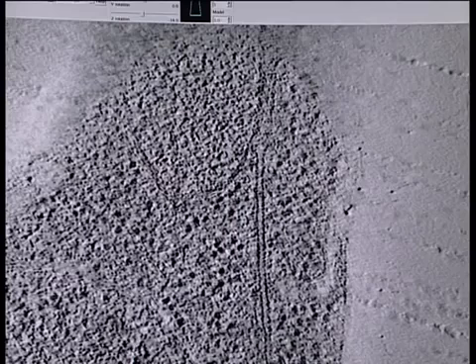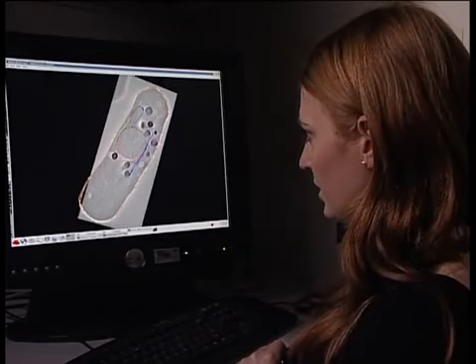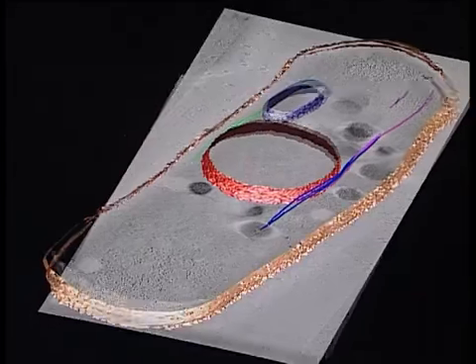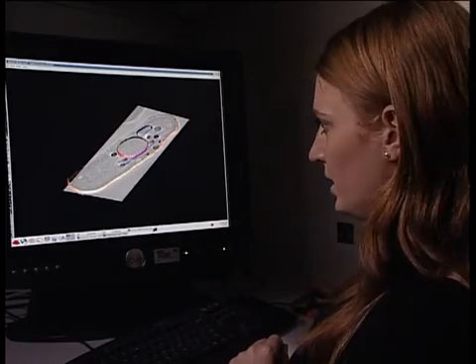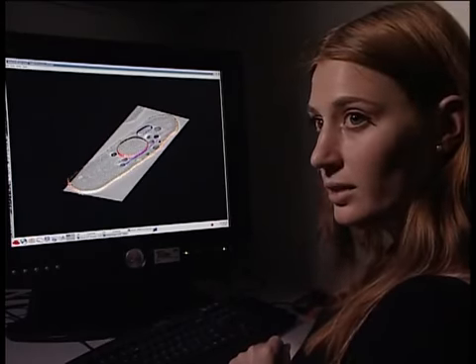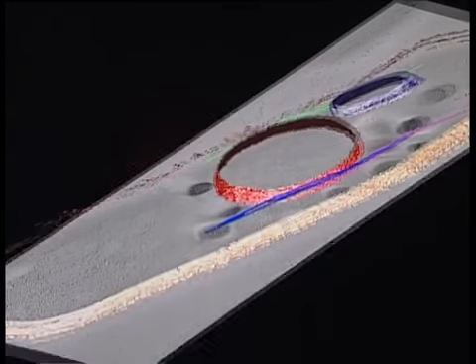You see how it created the line there? When I have all these lines put together, it becomes a model. And this model is now 3-dimensional. So you can see nicely the details of the cell, and on top you can see the models. For example, in red here, the nuclear envelope, and then you have the microtubules laying around it.